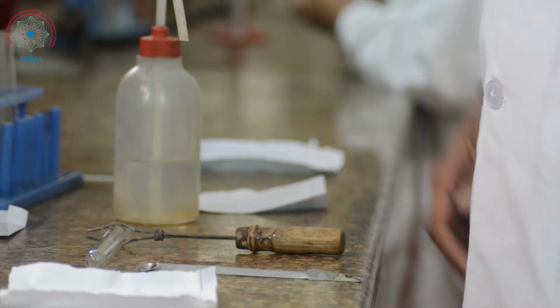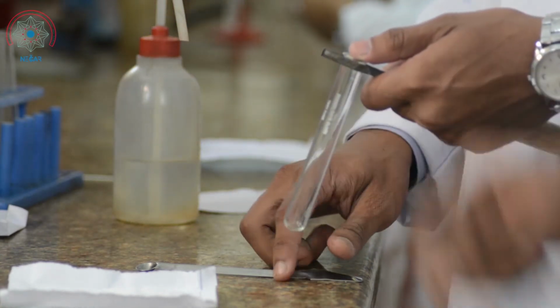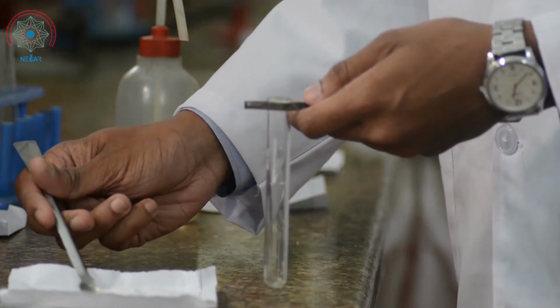Next, we will check the solubility of the salt. First, we will check the solubility in water. We will take a pinch of salt in a test tube, holding the test tube with a test tube holder.